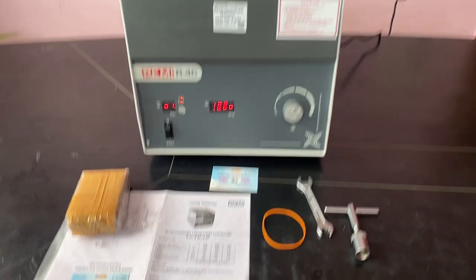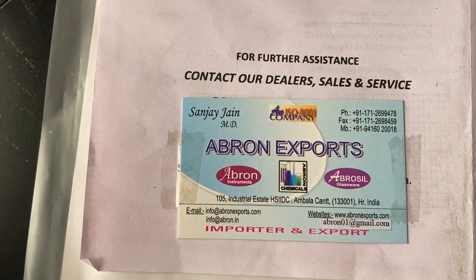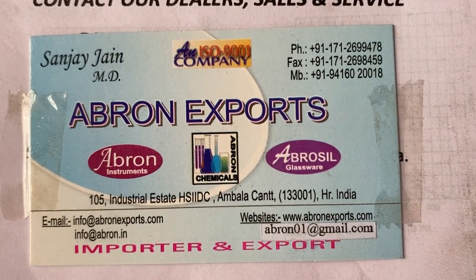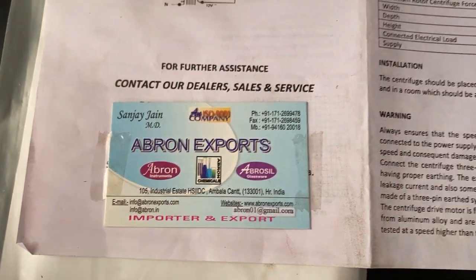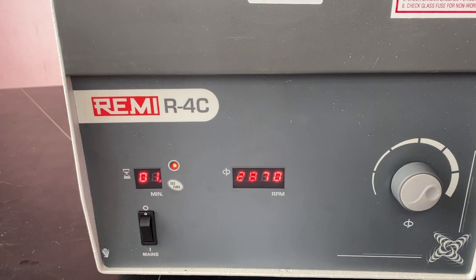Please visit the website Ebron01 and write us an email at ebron01@gmail.com. WhatsApp numbers are also available. Thank you very much. You can see the speed is increasing — I can take it to 4000 RPM.